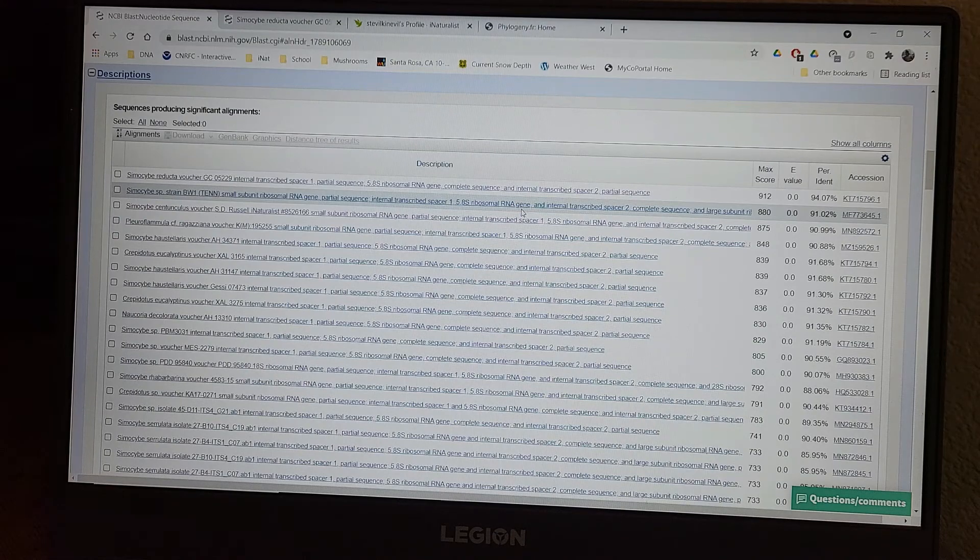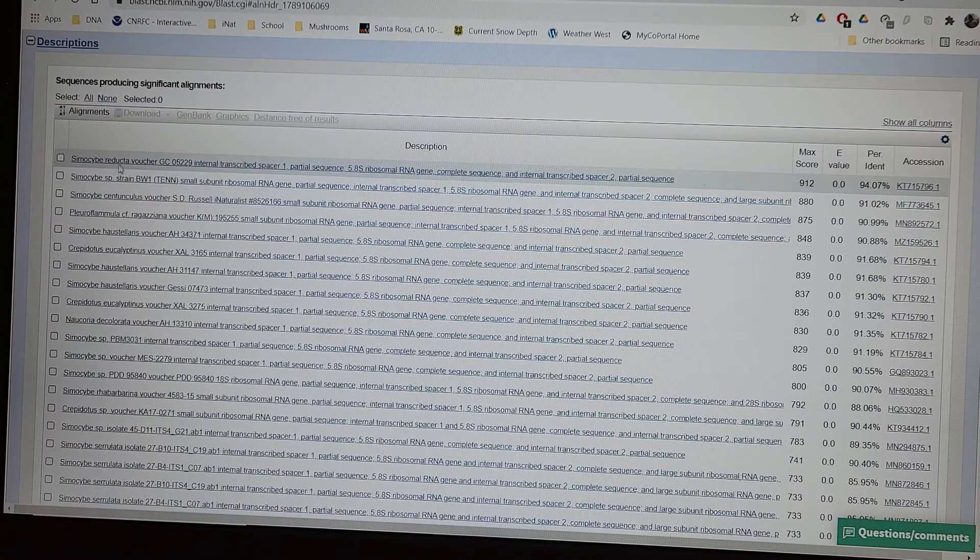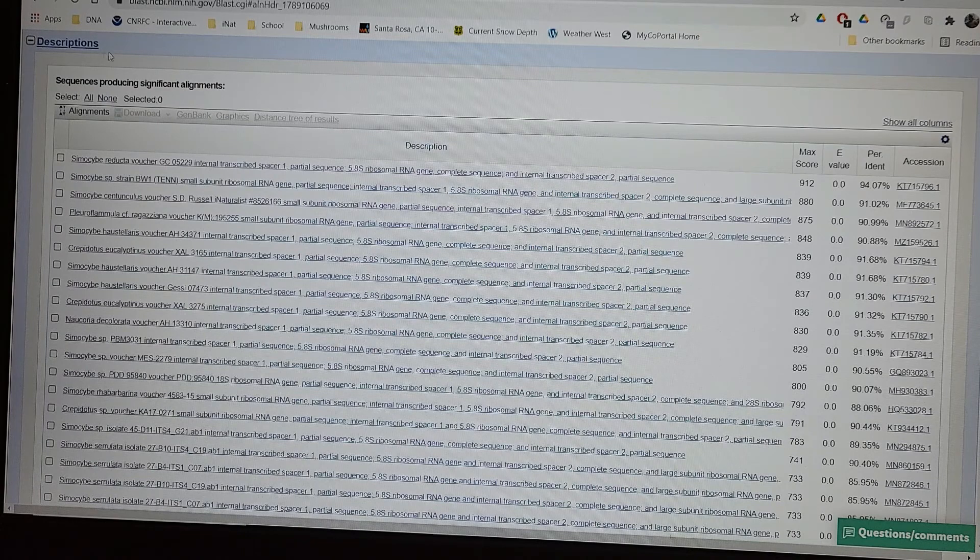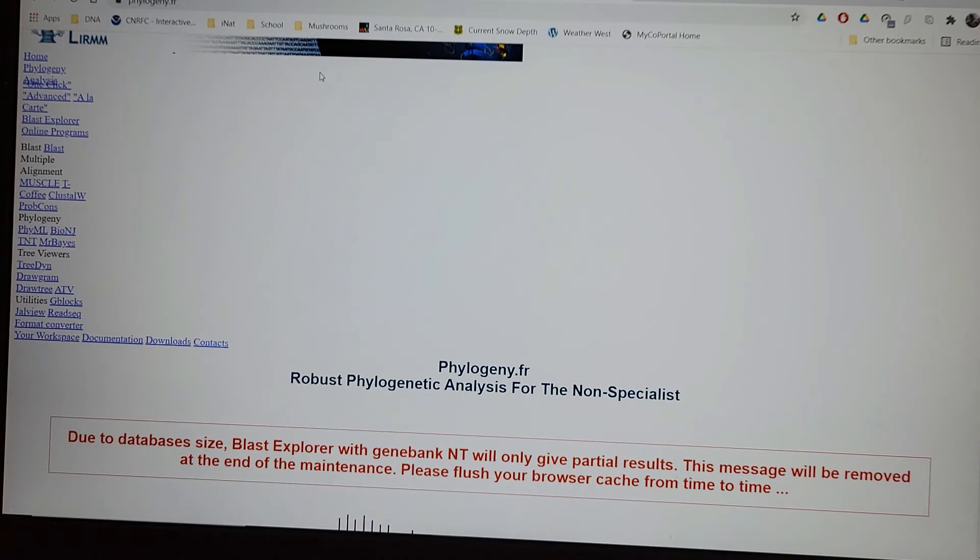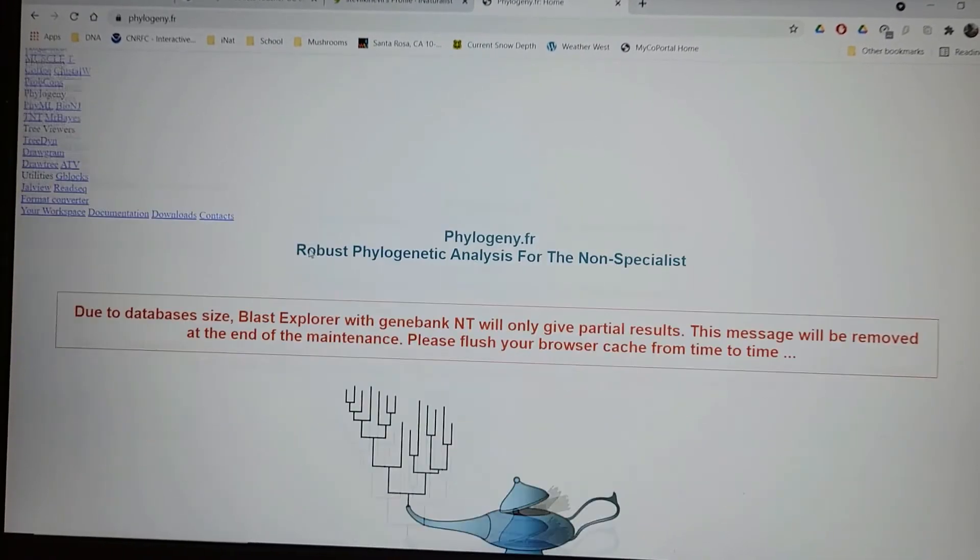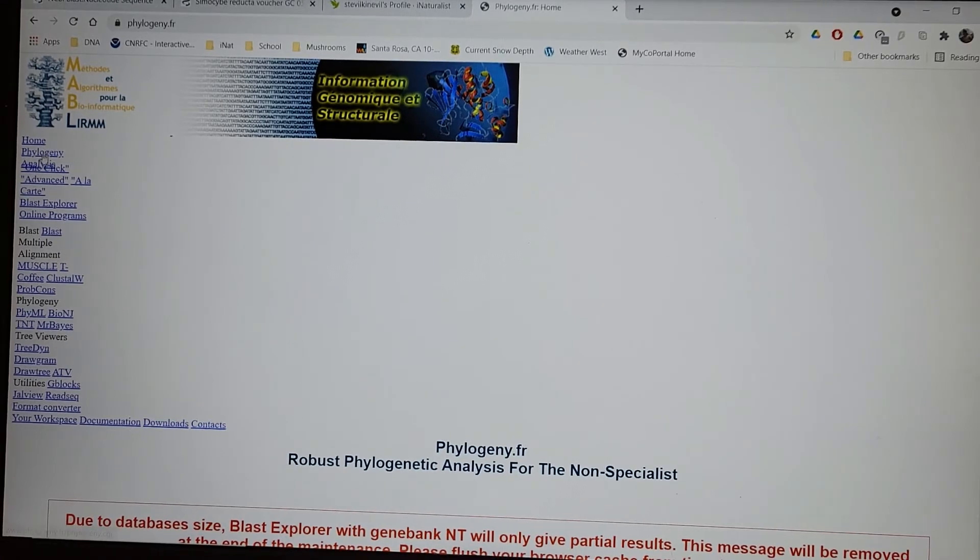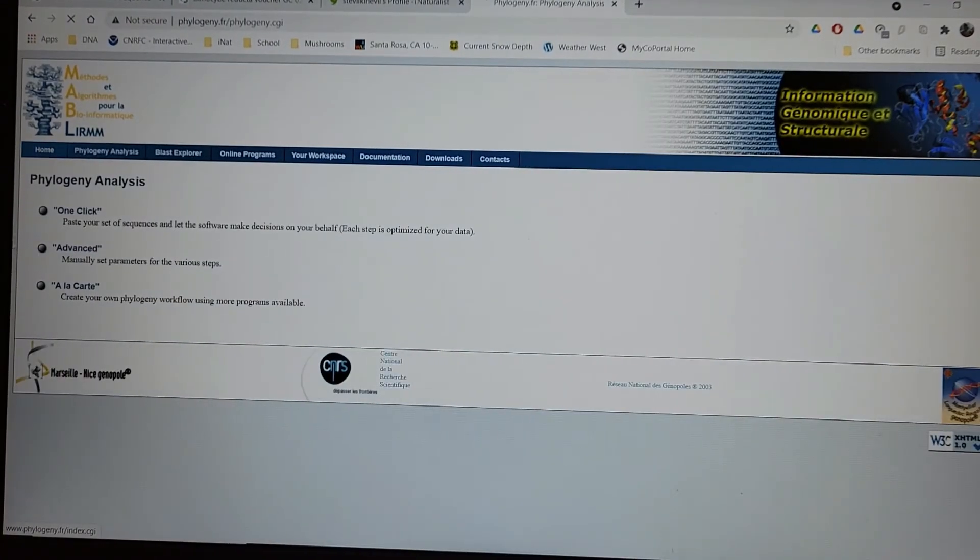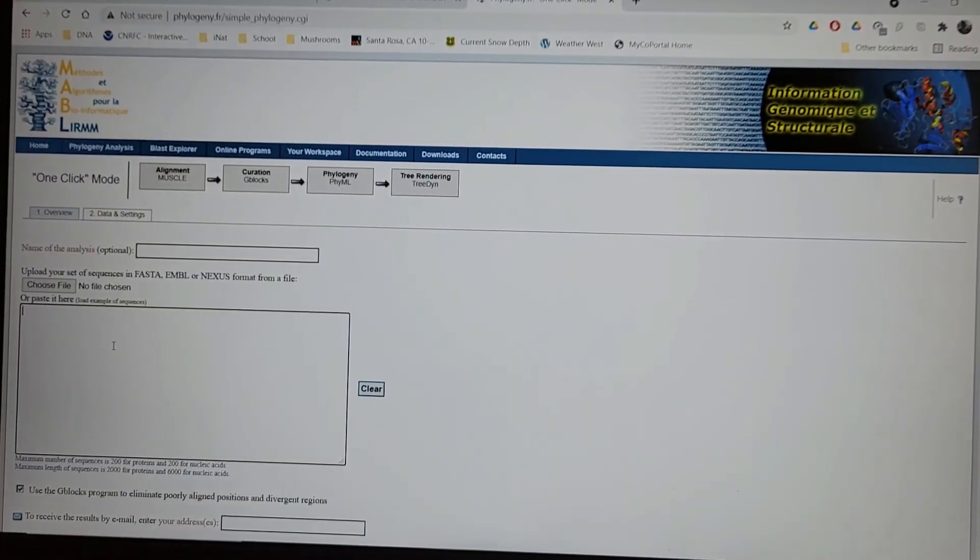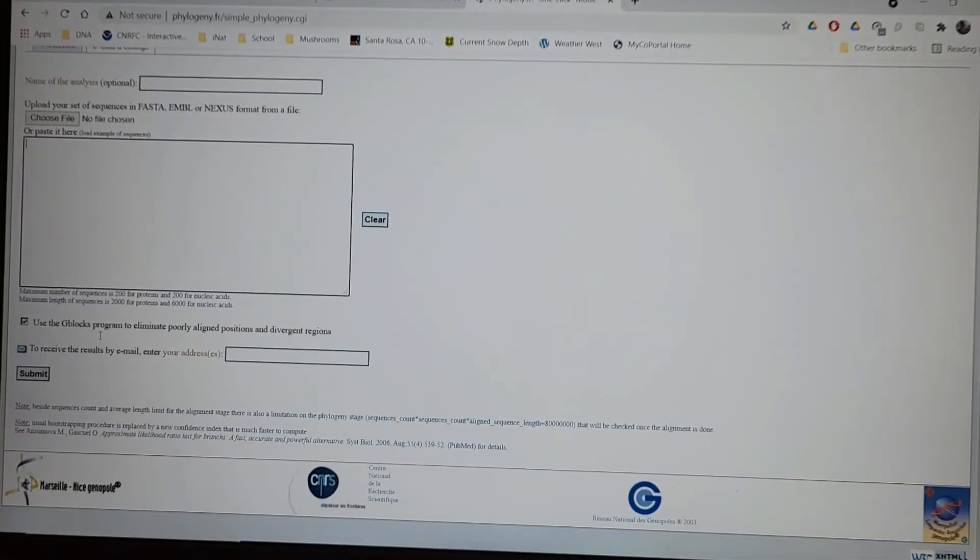So another cool thing that you can do with all this data here is you can click this box on all the sequences you want to download. And then you go to this website, phylogeny.fr. It's a French website and you can go click on phylogeny analysis. You do the one click and then you would basically upload all your different sequences here and you click submit.